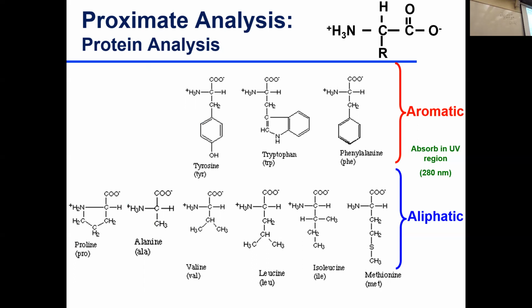So, what are you doing? No, just like, because they don't eat it, so would that just be really dark? No, because all proteins, in general, contain these aromatic amino acids and absorb at 280. So you can have a protein standard and run it at different concentrations, run the absorption at 280 on a standard curve, then get your sample and run it, and use the equation of the line to get the concentration of the protein.